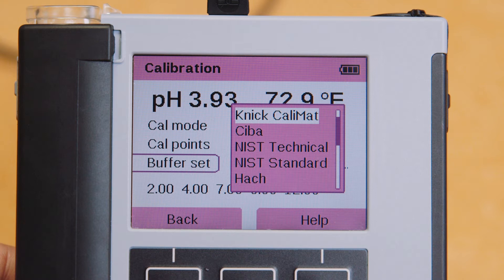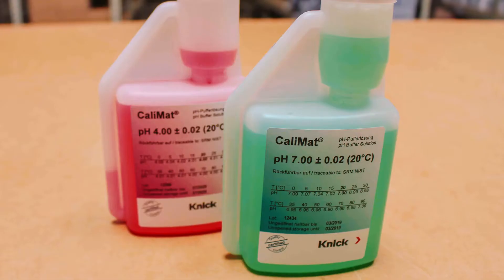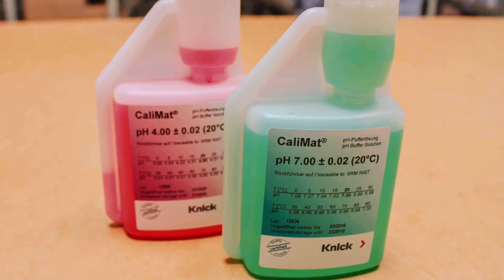It should be noted that the most common buffer on the market is NIST Technical. You can verify your buffer set by checking the labeling on your bottles.